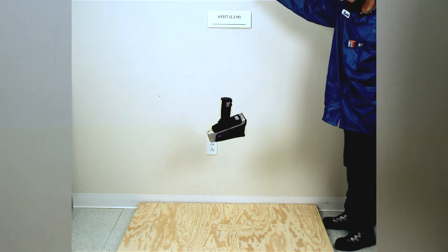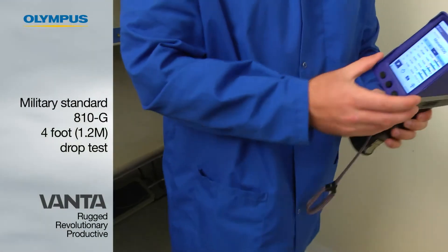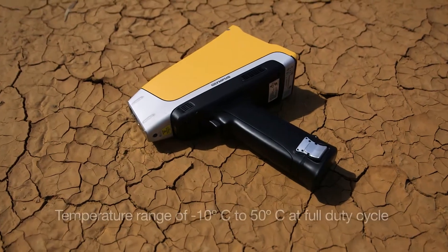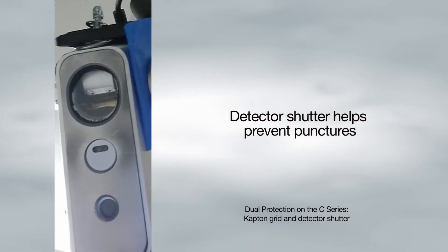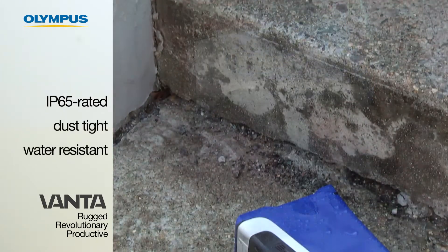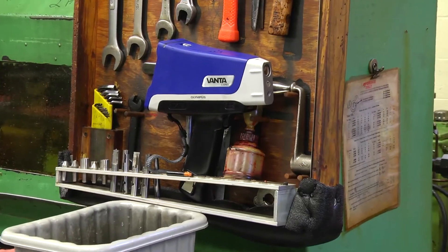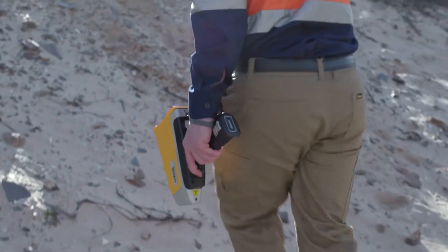We built the Vanta because people were asking for a rugged tool to be used in the field, so we built all these features into it to support that. It passes a drop test, it works continuously at 50 degrees C, it's got a detector shutter, and it's IP rated so it's water and dust resistant. It's really meant for in-field use — a tool to aid what you're doing in the field.